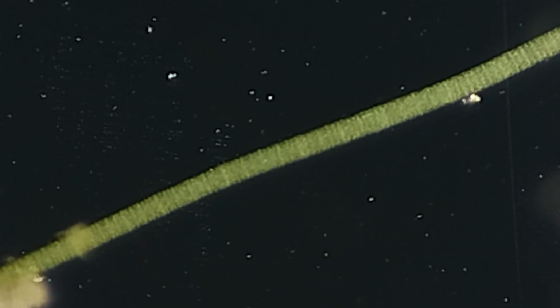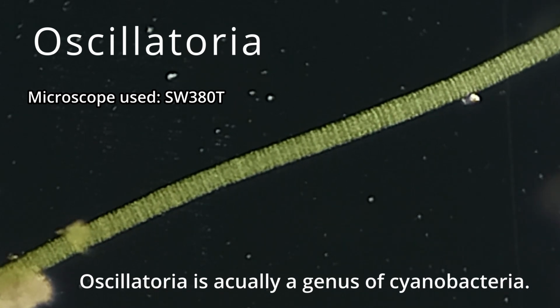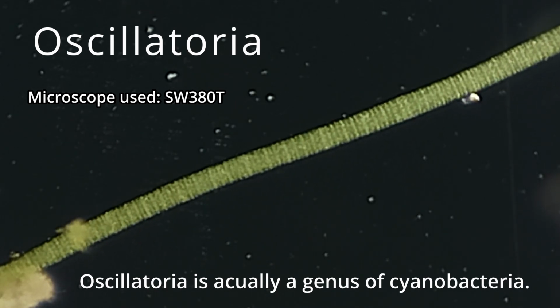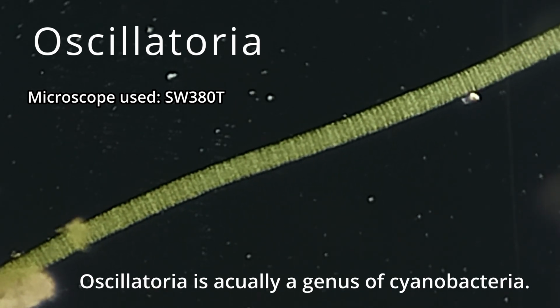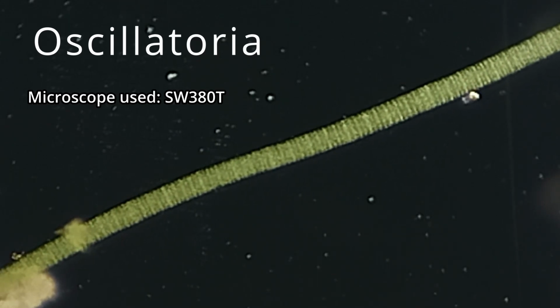While this might look like more macroalgae, it is actually a filamentous colony of Oscillatoria, which is a genus of cyanobacteria. Like macroalgae, cyanobacteria can also perform photosynthesis.